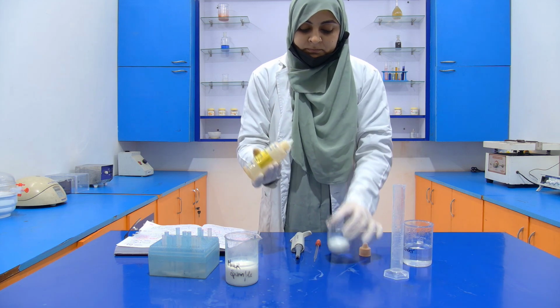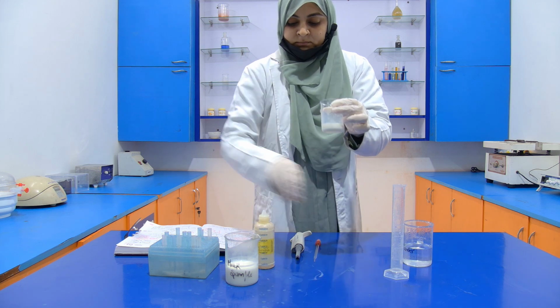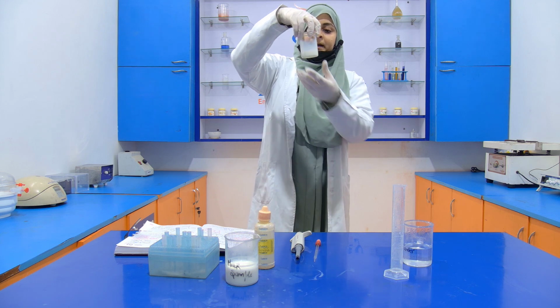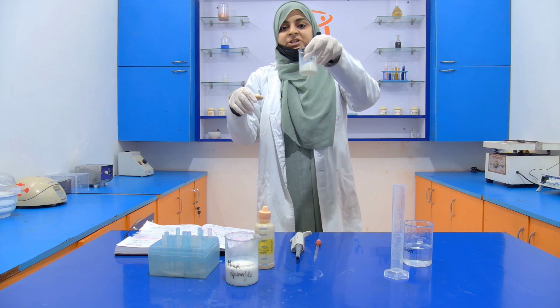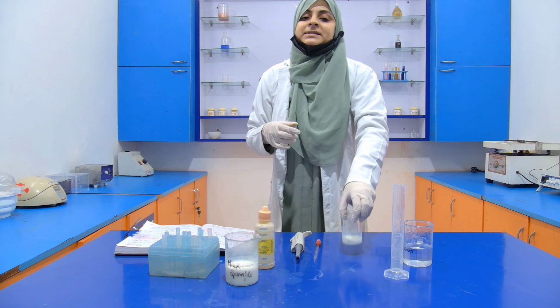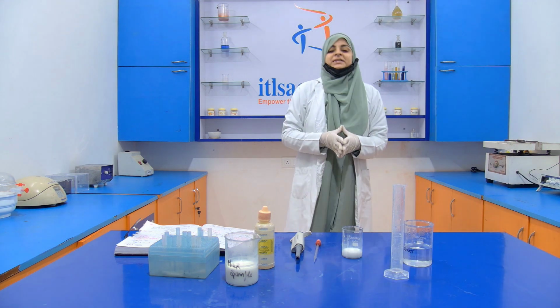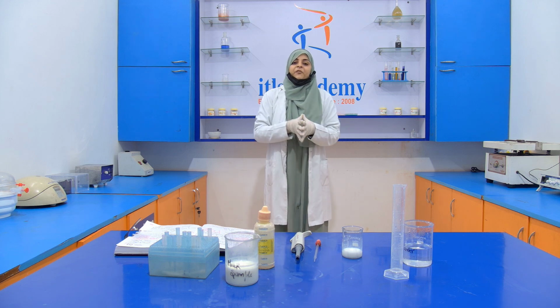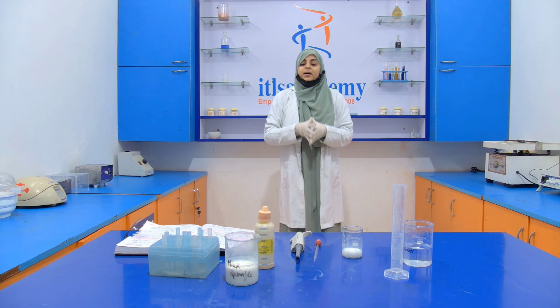Now I add 2 to 3 drops. There is no change in the color of the milk, which indicates that the pulverized soap is absent in our sample. Okay, which means that this pulverized soap is absent in our sample. So this is how we perform the detection of pulverized soap in the milk sample.